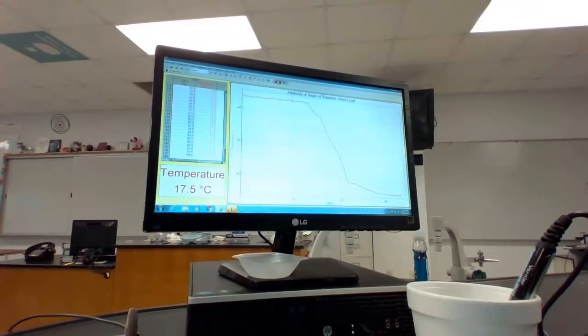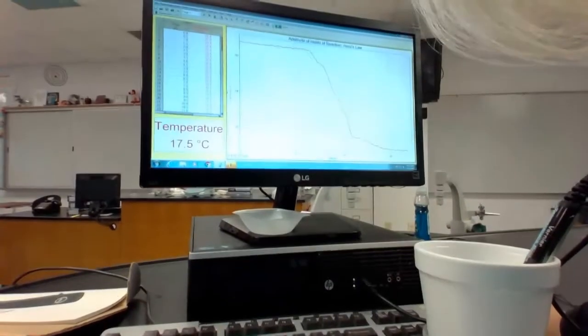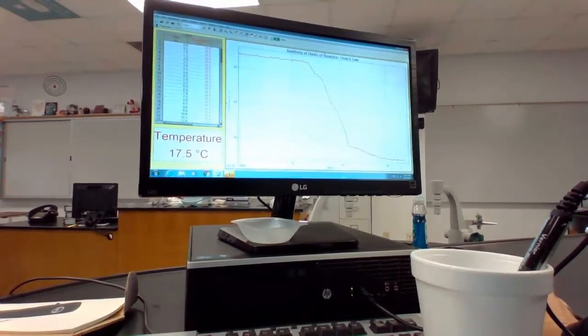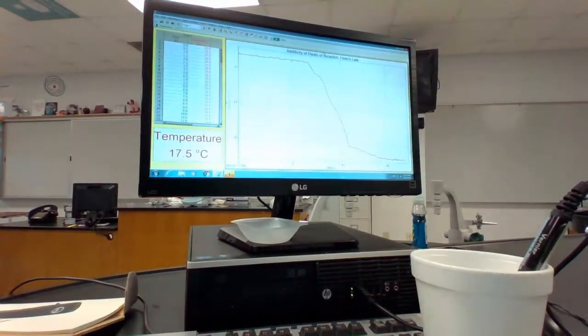And what we have is a temperature profile over time here. So what I want to do is I want you to look at, okay, exactly what is this telling me? So this is telling me that, in fact, I had a pretty constant temperature to begin with. And then my temperature started to go down quite a bit. And then I had pretty much a leveling off of the temperature at the end, with basically the lowest temperature being down here at the end. And so we have to ask ourselves, well, what is going on there, and what is that telling us?